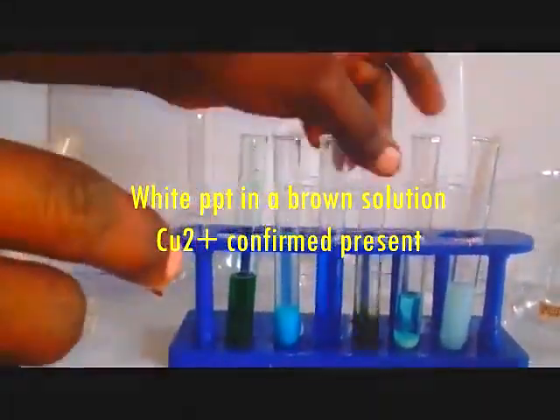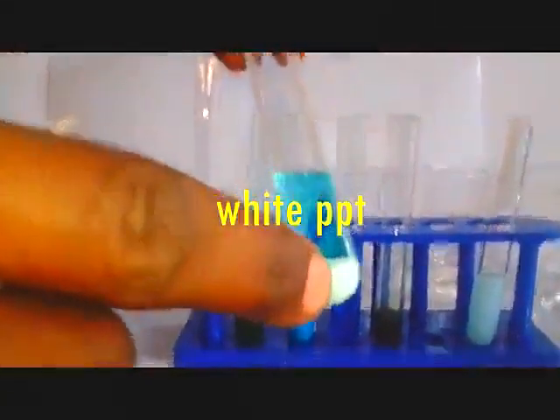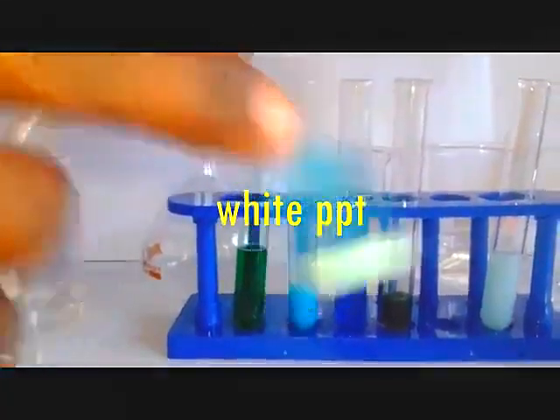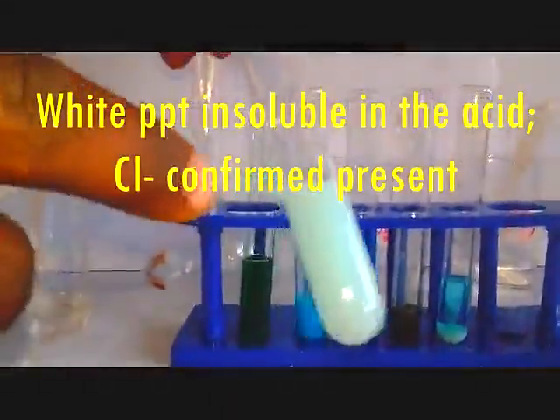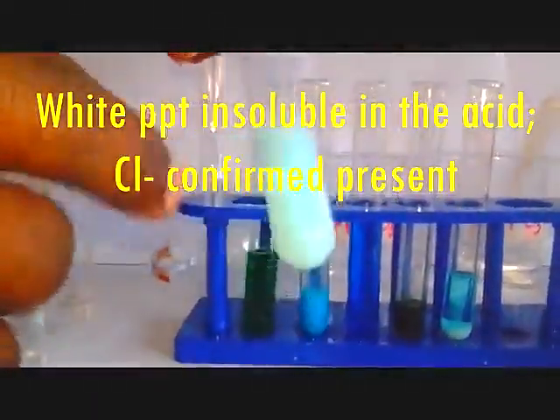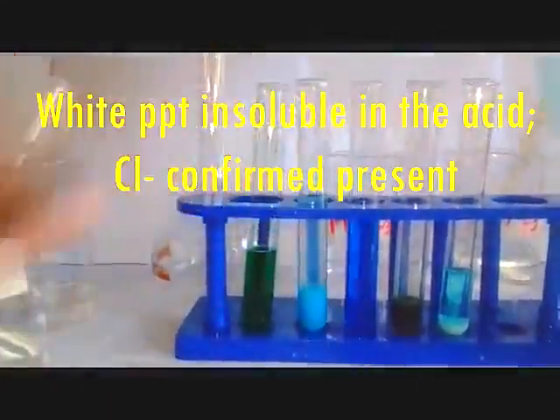When we added lead 2 nitrate, we got a white PPT, suspected chloride and sulfate ions. When we added silver nitrate, we got a white PPT insoluble in the acid, and we confirmed the chloride ions.